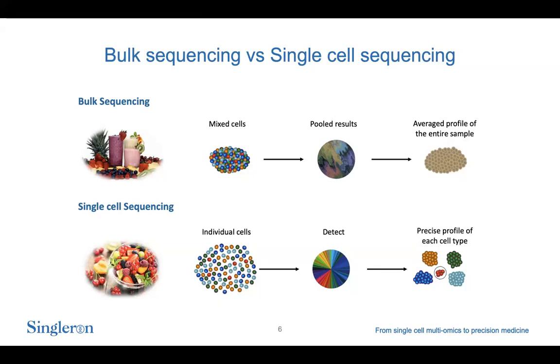in your sample. And this is of great importance because the majority of tissues that you most likely work with do not comprise only one cell type. It's almost always a mixture of different types of cells. And in order for you to understand which genes are expressed to what kind of levels in these different types of cell types, single-cell sequencing, I think, is the key.